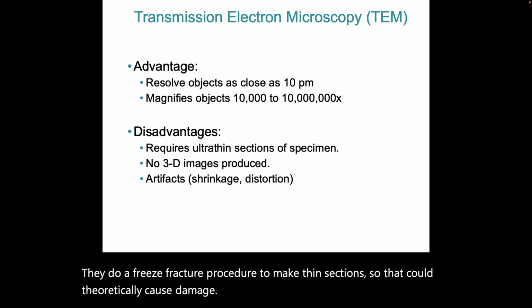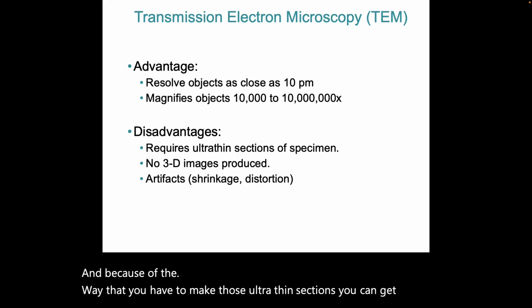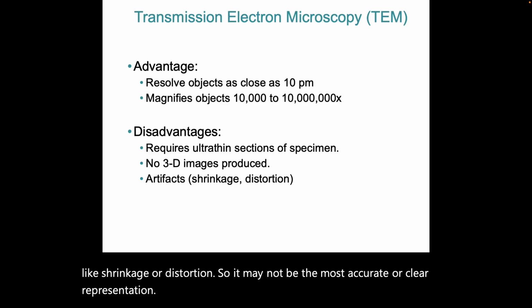It doesn't produce a three-dimensional image. And because of the way that you have to make those ultra thin sections, you can get artifacts like shrinkage or distortion. So it may not be the most accurate or clear representation, but you get a solid idea.